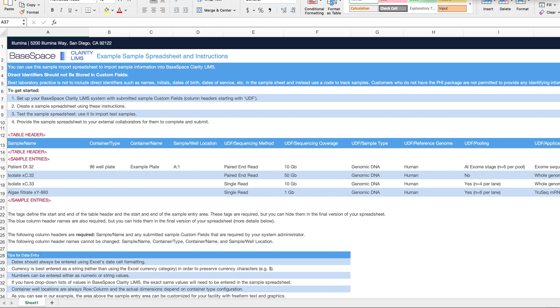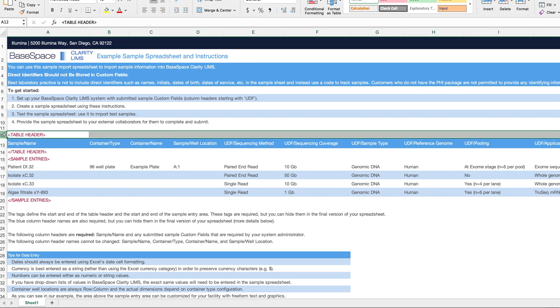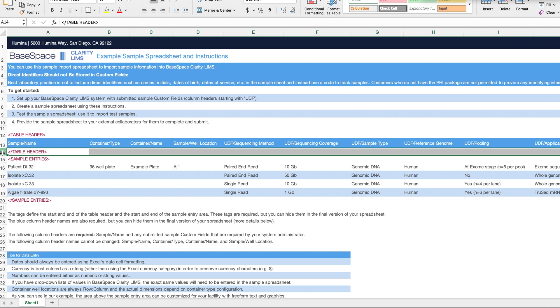The important lines to pay attention to are lines 12, 14, 15, and 20. On lines 12 and 14 you have the opening and closing tags for the custom fields. These are fields that have been configured in your Clarity LIMS system and will be metadata brought in on your parent sample.